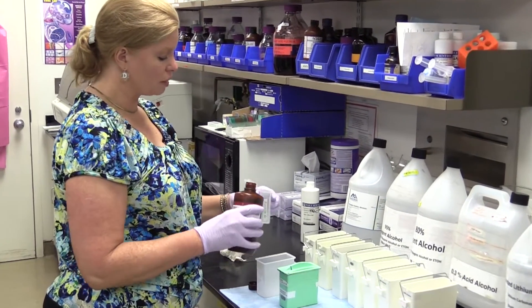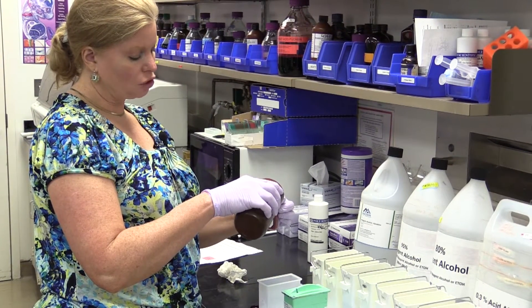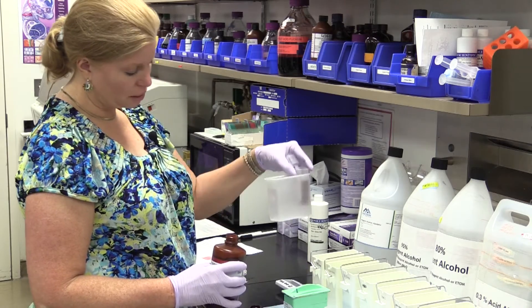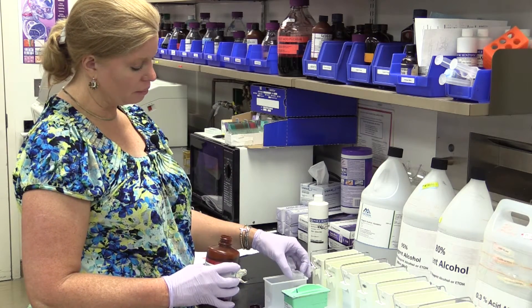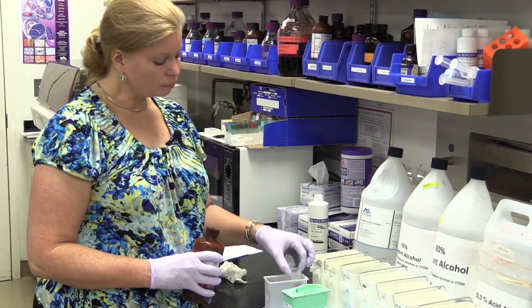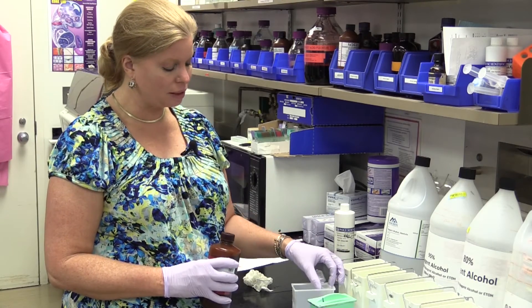I'm going to fill this container about two thirds — that's all I need — and I'm going to use this flip-top slide mailer to hold my slides. It's actually really good for little mini staining setups if you just have a couple of slides to get through.